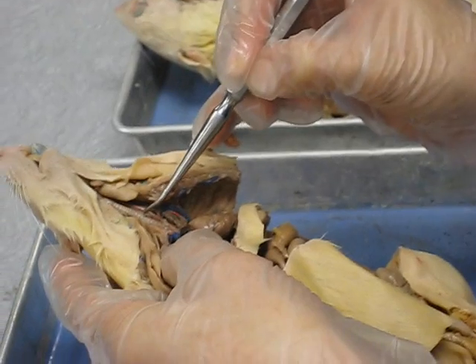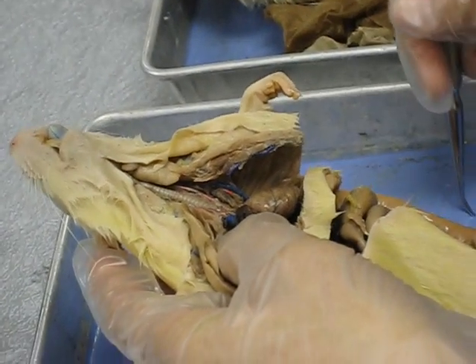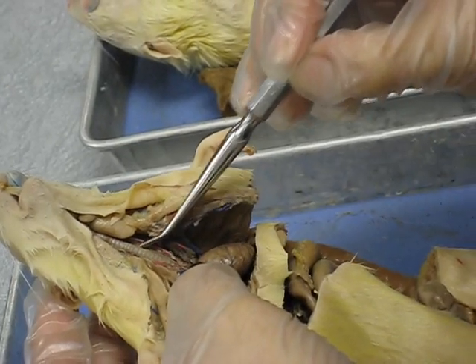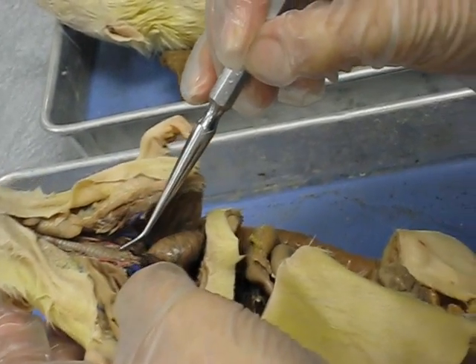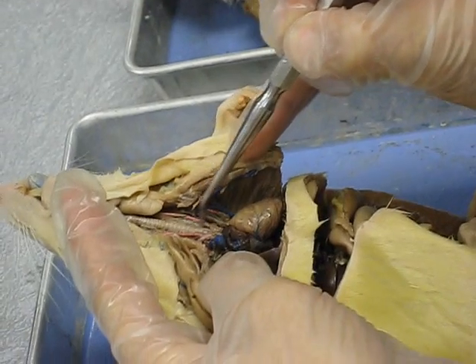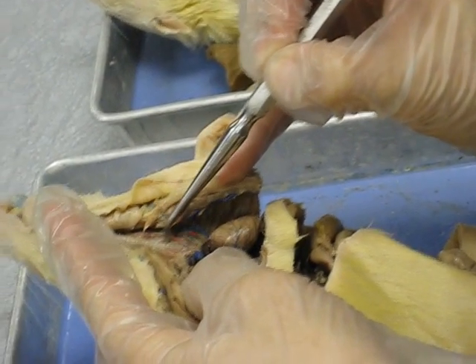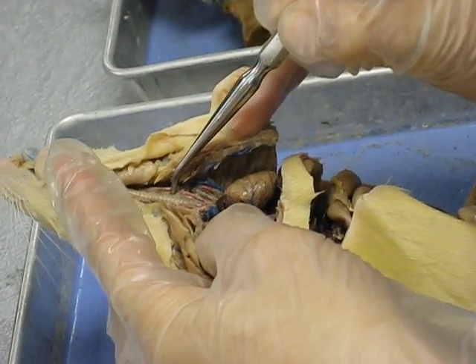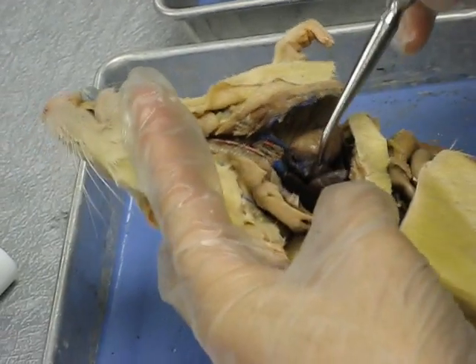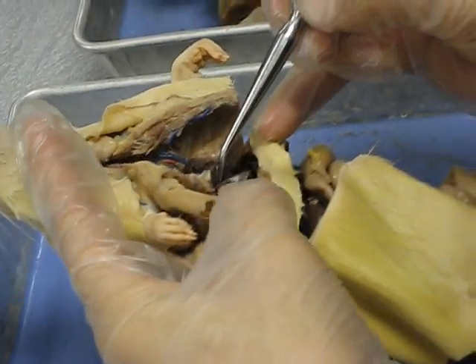So then we move to the lungs. What is this? The trachea. See how you can see those little lines — those are part of the cartilaginous thickenings, so it's really distinct. Now the esophagus runs kind of along the side or behind it. This is the esophagus right here — see that? That looks like muscle but it's really close — that's the esophagus.